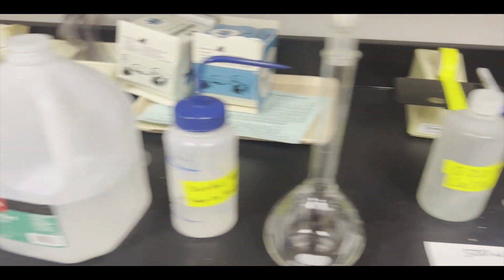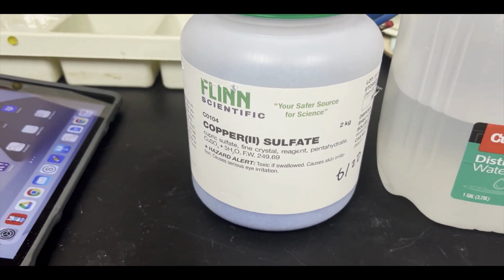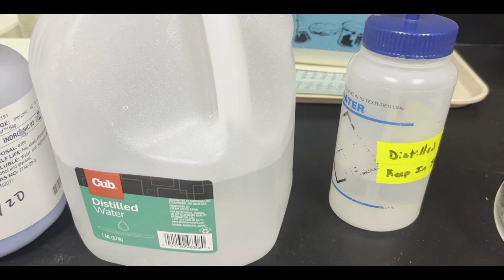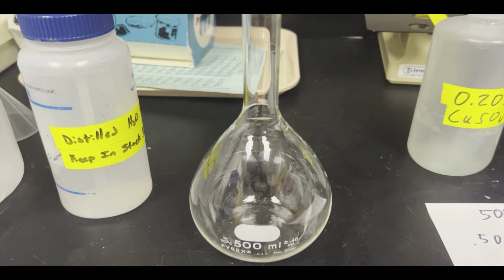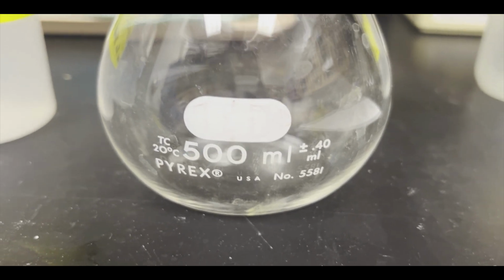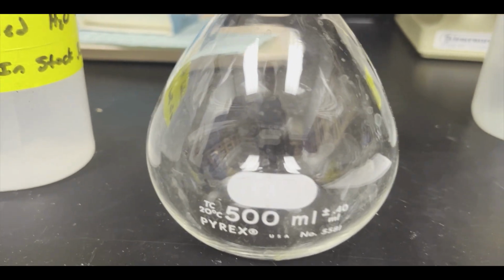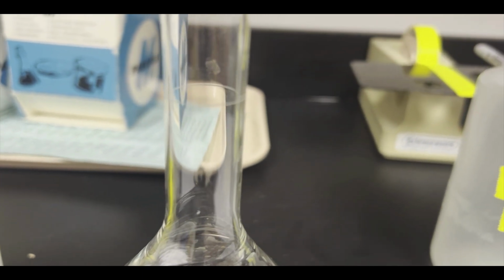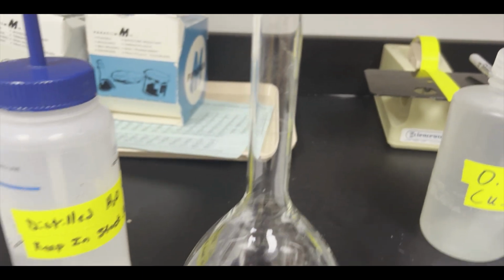Okay, so to do that, we of course need to have our copper sulfate solid first. We're going to need to have distilled water, and we're going to need to have a volumetric flask. So we want to make 500 milliliters of this, so we're going to use a 500 milliliter flask because volumetric flasks only have a single line on them. You can see it right here. So they only can measure one volume as we do this.